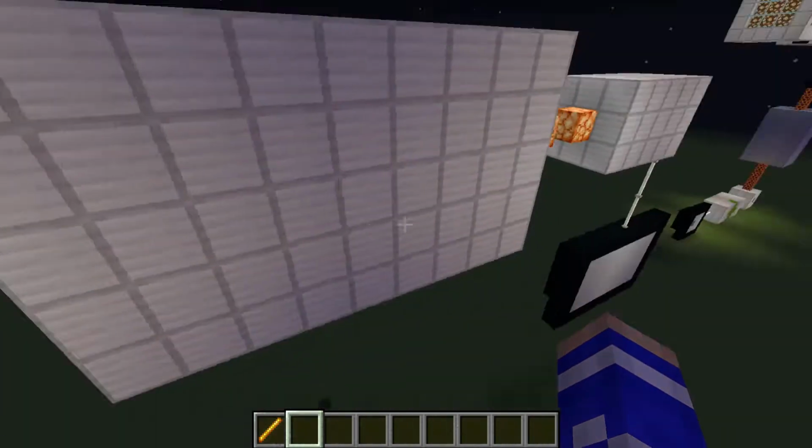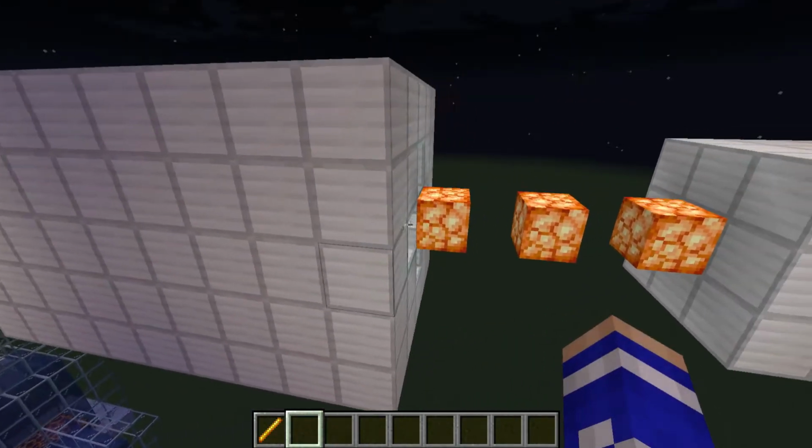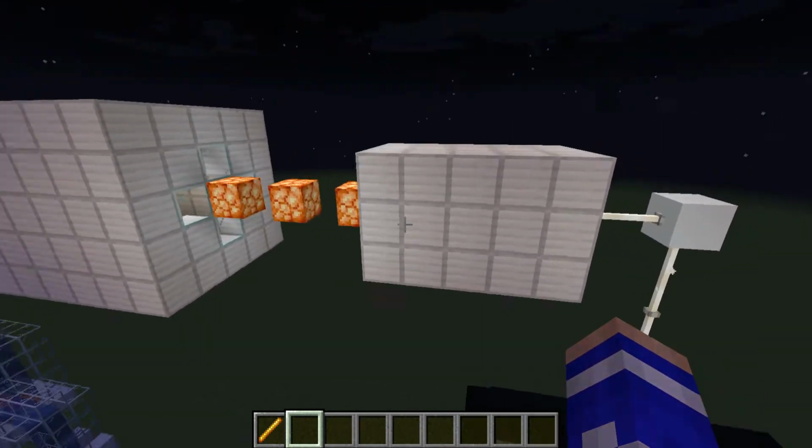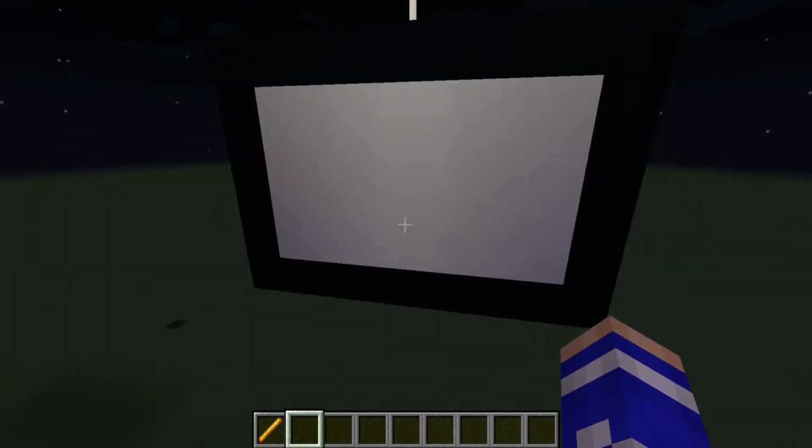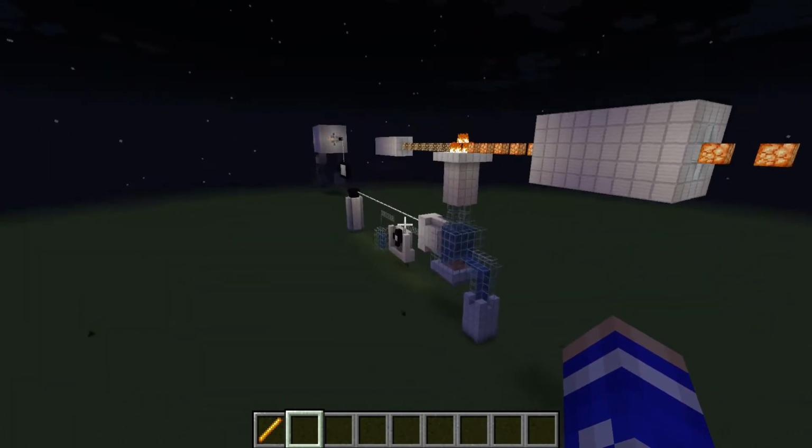That light will go into a monochromator just like before. Wavelengths will be specified to the ones we want to analyze, into a photomultiplier detector, and down to our readout where we can analyze the results.